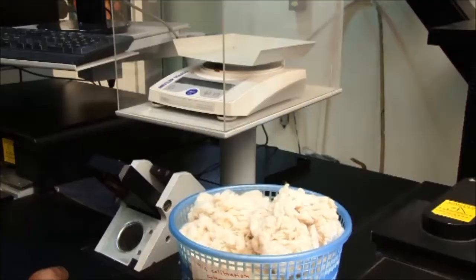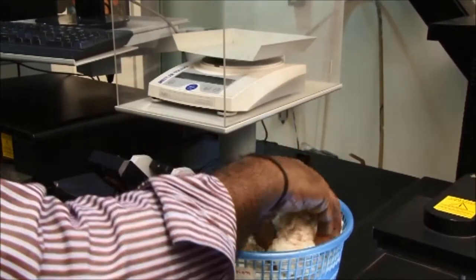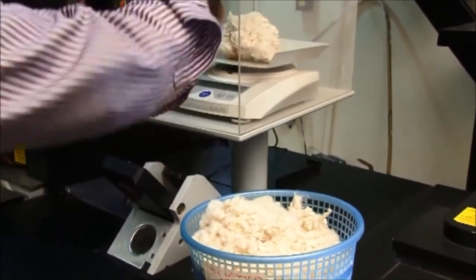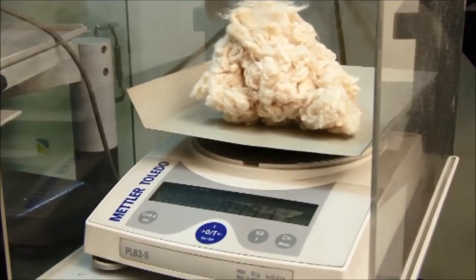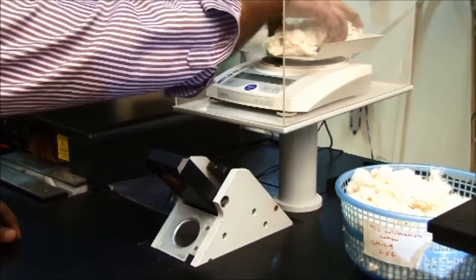Calibration is carried out with universal HVI calibration cotton, micronaire calibration cotton, and USDA color calibration materials.